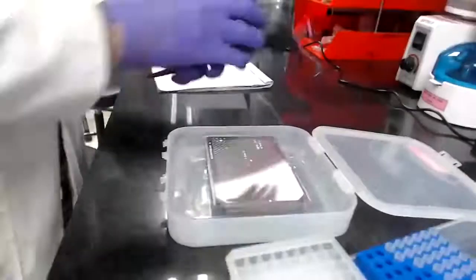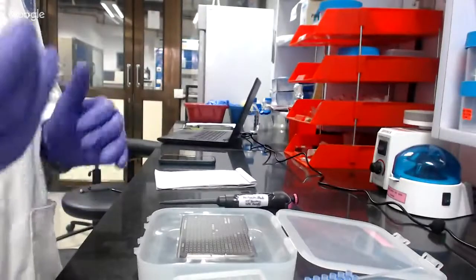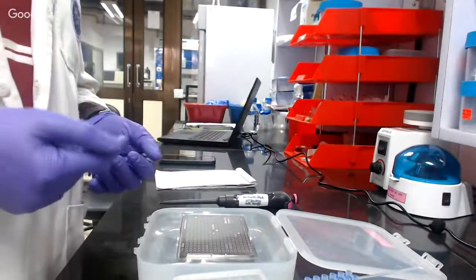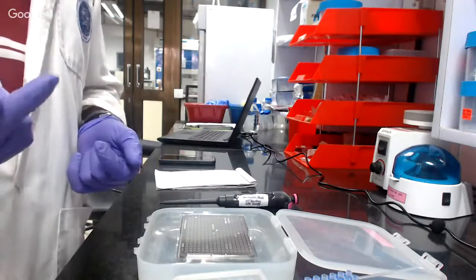Now we have spotted only one sample. Now we have to wait for 10 to 15 minutes, and once the samples get dry, then we'll put it in our instrument, MALDI TOF, and then we can do the analysis.